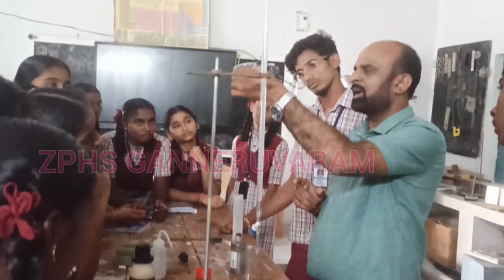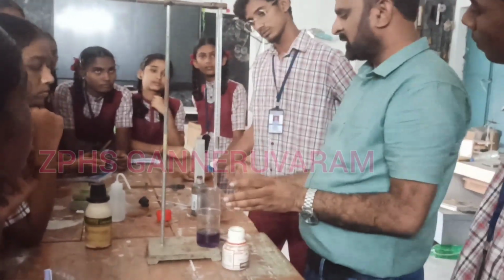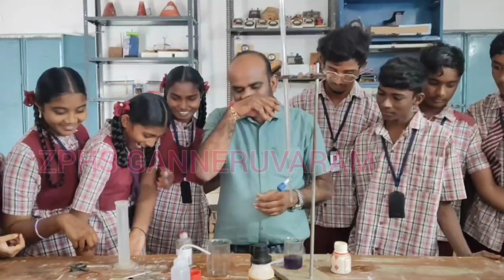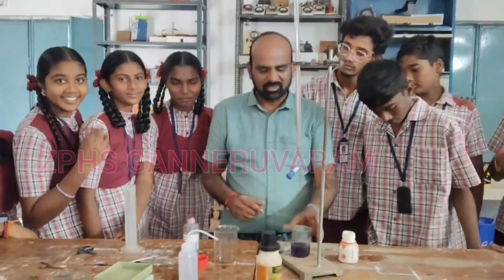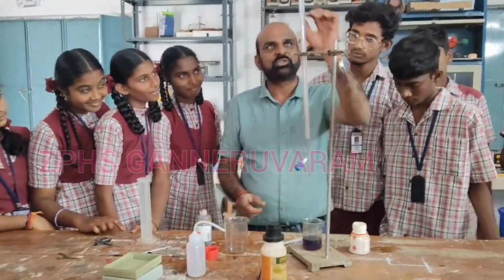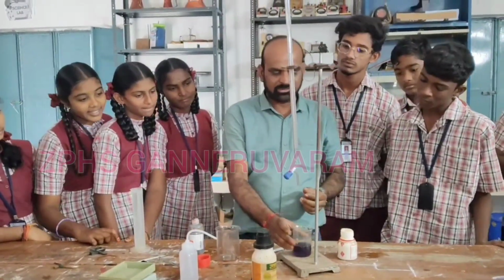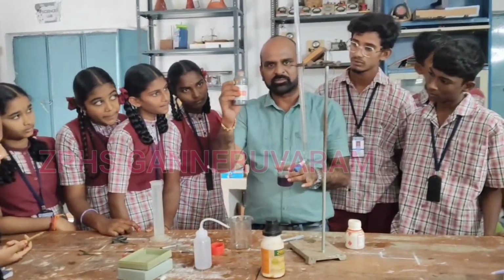And by titrating this, you take the HCl in this. Today I am going to explain about the neutralization reaction. Now I have taken this HCl solution in the burette and sodium hydroxide solution in the beaker, and adding the red litmus.